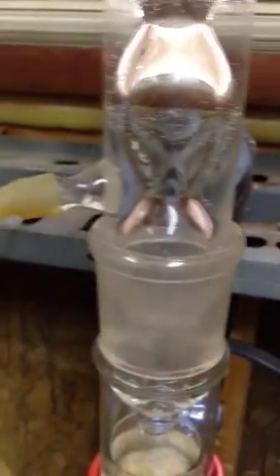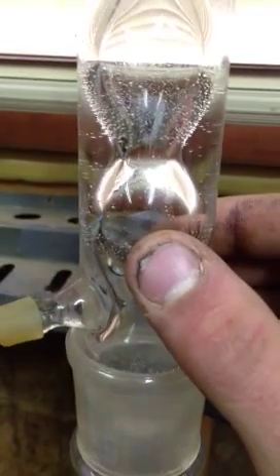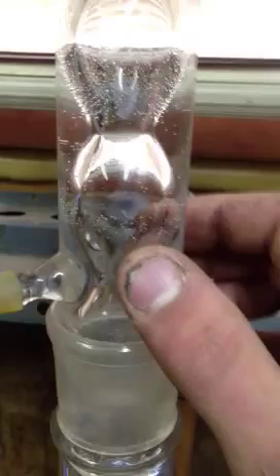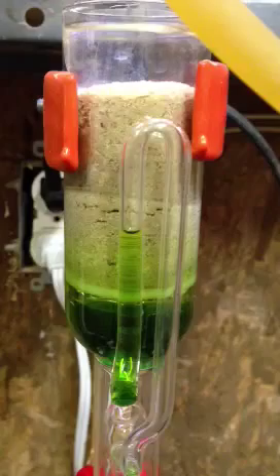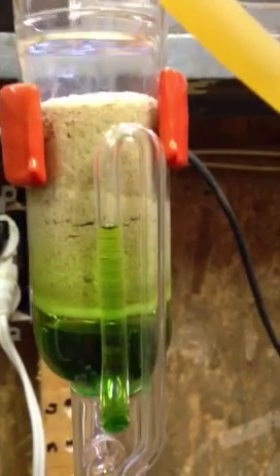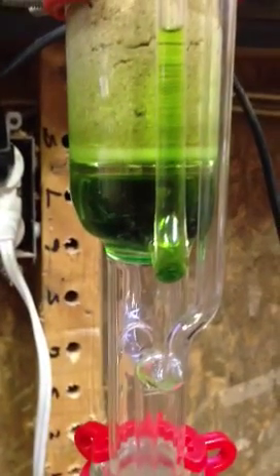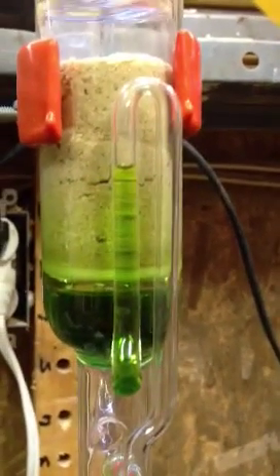Cold water is pumped in through the bottom of the condenser and drains out the top. As the hot vapor touches the cold glass on the inside, it condenses back into a liquid, and the liquid drips back into the thimble inside. The thimble holds your material — it's just ground up leaves in there. So the alcohol drips and flows through your material through the thimble, and extracts any oils that are within the plant.